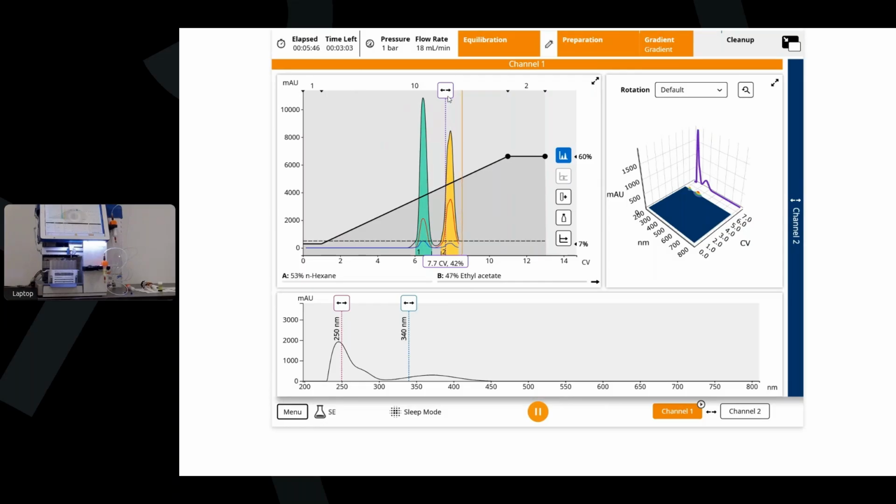So one thing you'll see at the end of this, and something that I didn't talk about with the hardware at the beginning, is all of our mechanical bits, all of our tubing, even our UV flow cell is accessible to the customer. So keeping the system running as expected, making sure that we have our lines cleaned, or even able to be flushed without having to completely take apart the system, is kind of a feature of making sure that your runs are going to work from run to run. So easy maintenance and high quality columns are going to lead to that reproducibility.